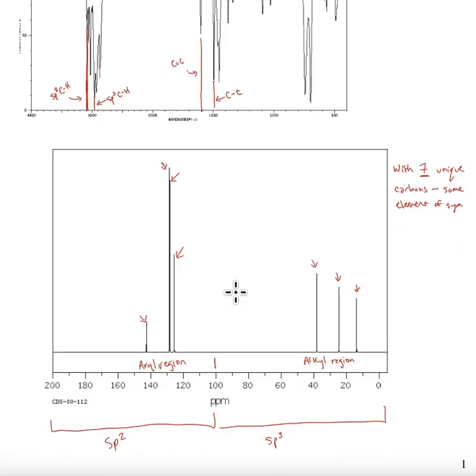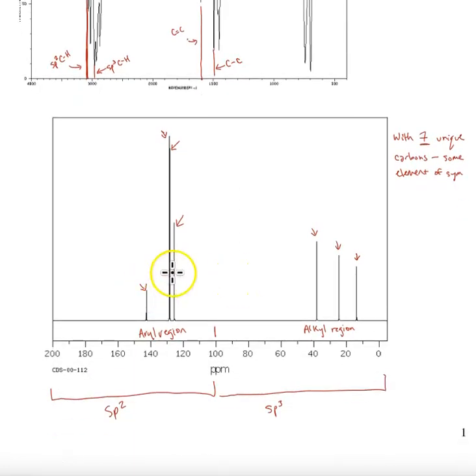Moving down, we are looking at our carbon-13 NMR spectroscopy chart. These charts tell us a lot about the carbon skeleton of our molecule. The number of peaks tells us how many distinct carbons are in an environment.